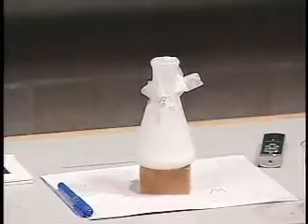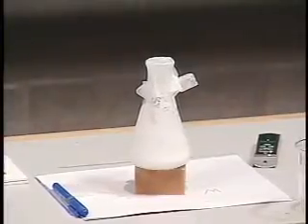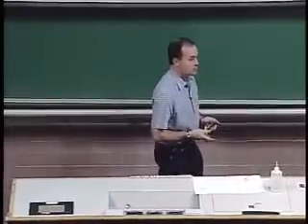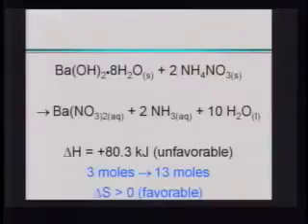I can show you just how endothermic this reaction really is. So what I'm claiming is that it's an endothermic reaction, but 3 moles are becoming 13 moles. That's a huge increase in entropy. These two things are solid, they're crystalline. The molecules in the atoms are held in very rigid formations.